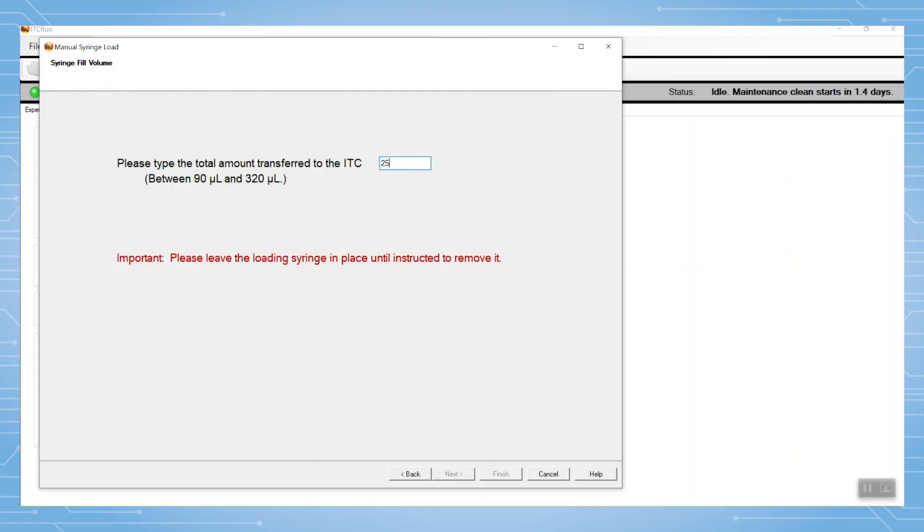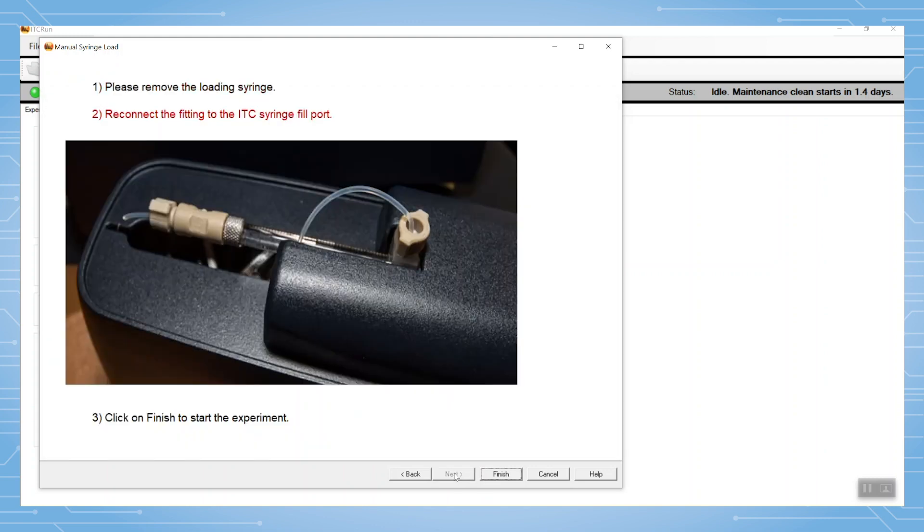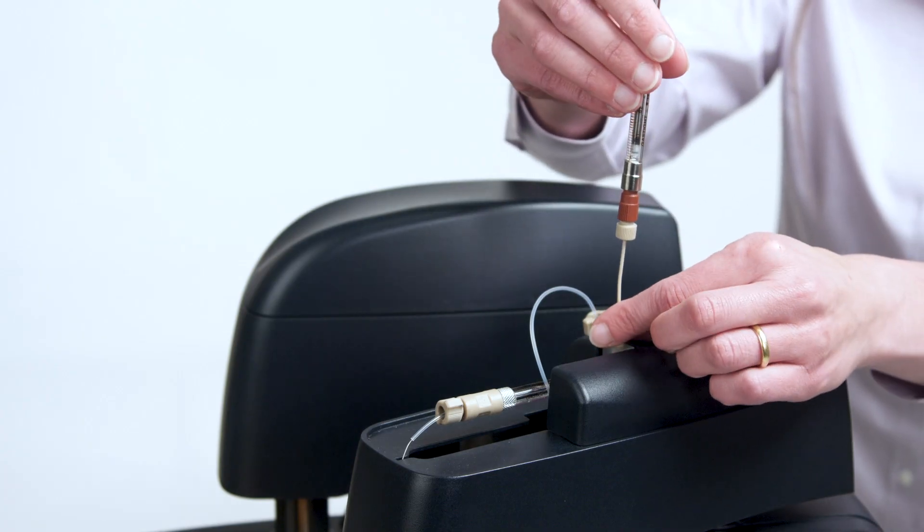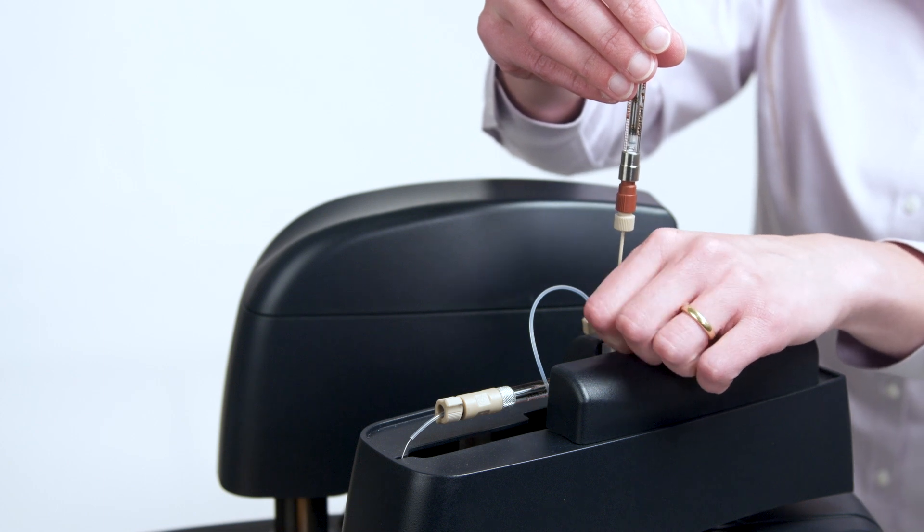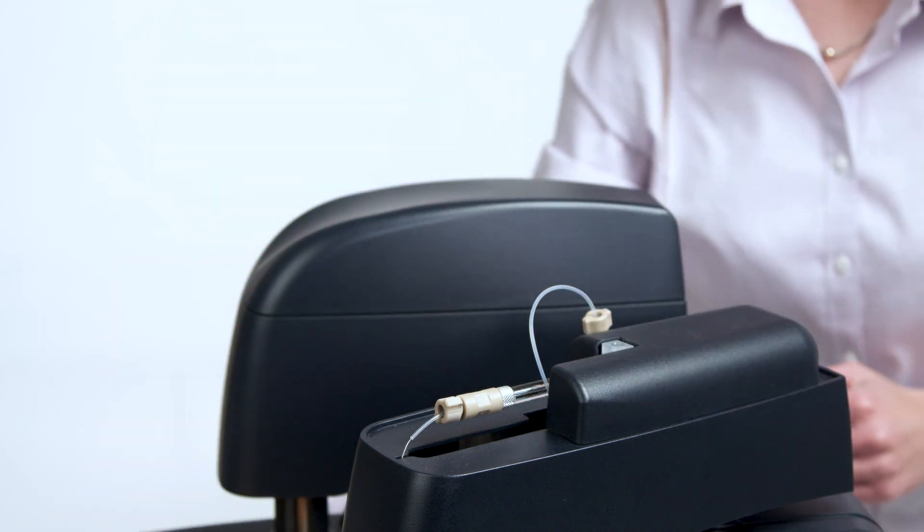Now the filling syringe is left in place and next should be clicked to progress in the wizard. The plunger then automatically moves to the correct position for the titration experiment and the pump is turned off.